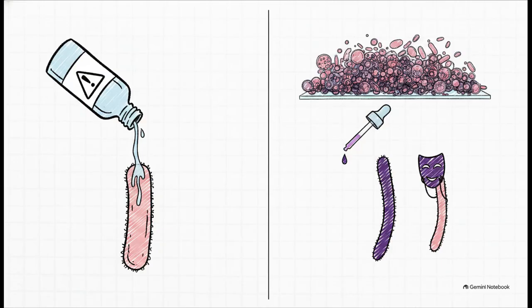If you guessed the decolorization step, you hit the nail on the head. Because slipping up right here gives your suspect a completely false identity, which leads to catastrophic lab errors. Think about it. If you over-decolorize, your thick-walled, gram-positive organisms will lose their purple dye and appear falsely gram-negative. But if you under-decolorize, your gram-negatives hold onto the purple and look falsely gram-positive.